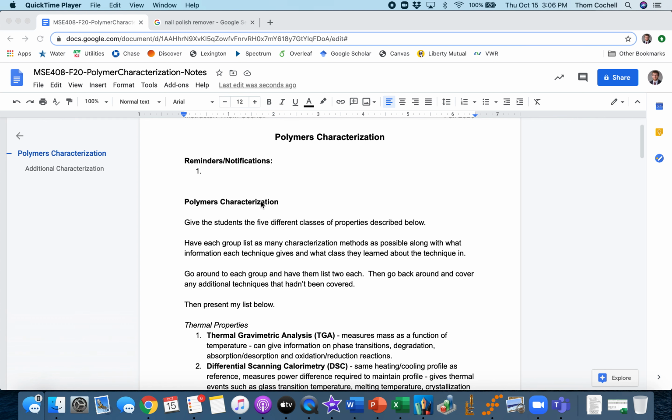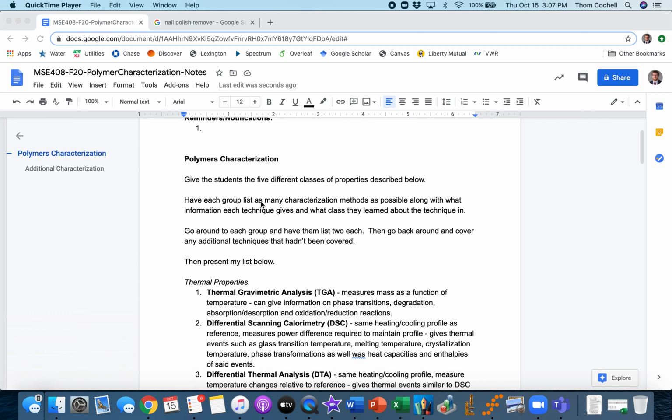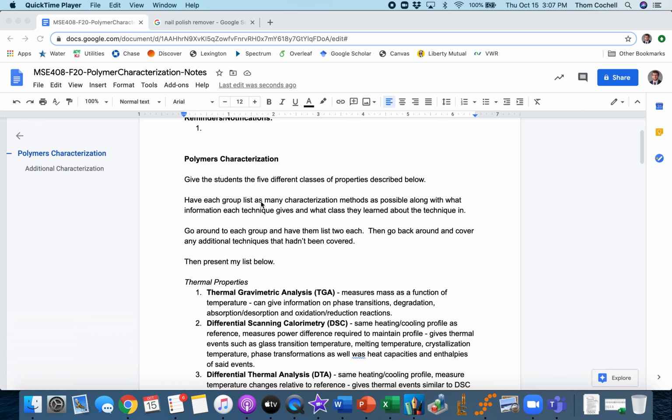All right, in this video, I want to go over some of the additional tests that we can do. So in the lab, I have a certain set of required techniques that we're going to do: DSC, density, tensile testing, and XRD. But there are additional tests that can be helpful in the identification and characterization of your various polymers.